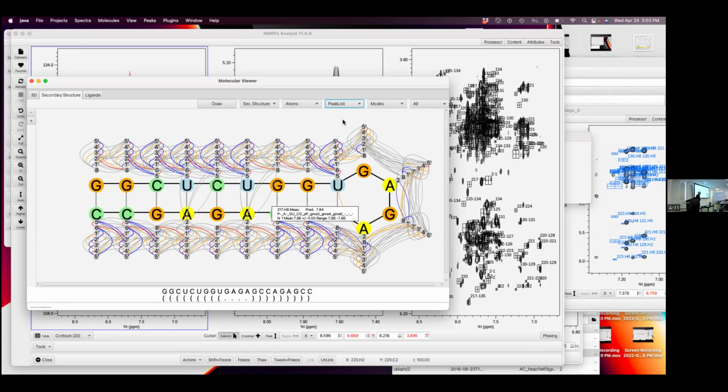This is the UTR. Yeah, this is the PBS fragment of the UTR, the primer binding sequence, and it's even truncated from the full. If you have proton, nitrogen HSQC, then we can see the full connection. Good if you can get that data. Right now, I don't do much with nitrogen here.